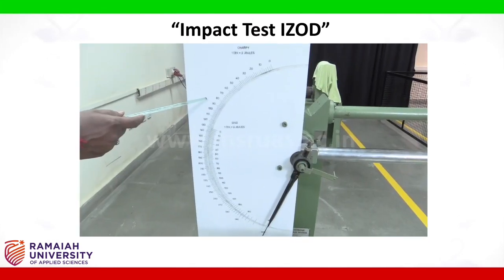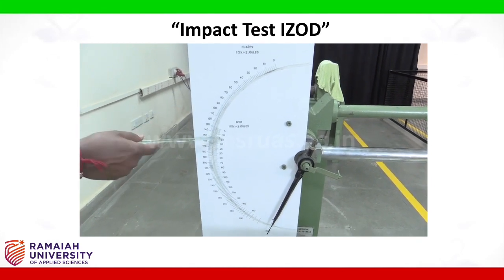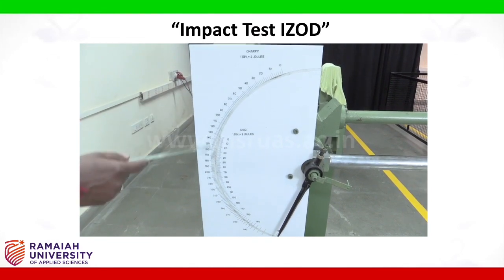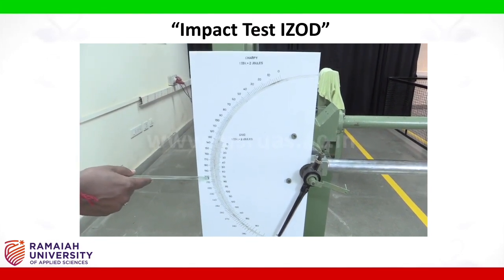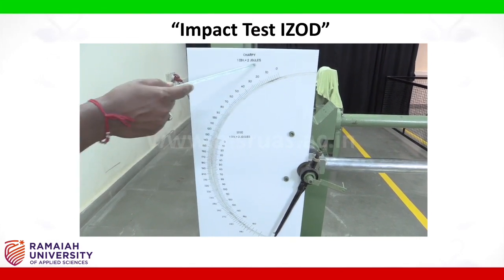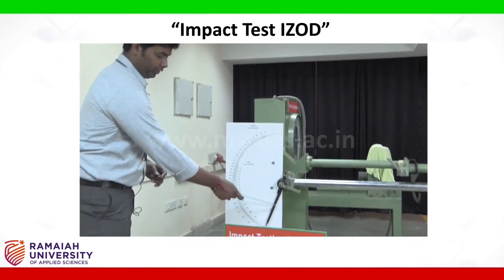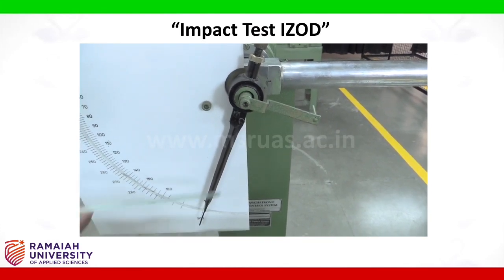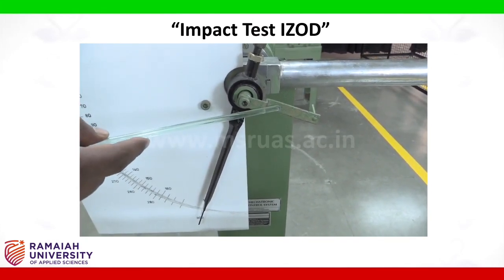This dial consists of two scales. This inner scale is for the Izod test and this outer scale is for the Charpy test. Here the least count of these two scales is 2 joules. Pointer, this is the pointer to take the readings and this one is the pointer carrier.